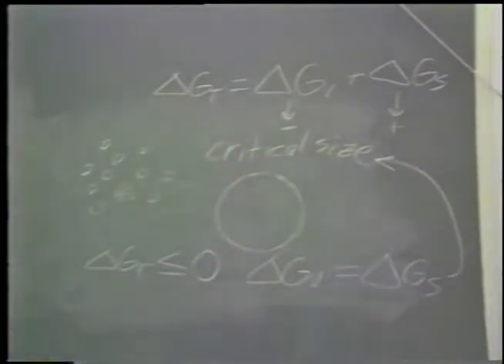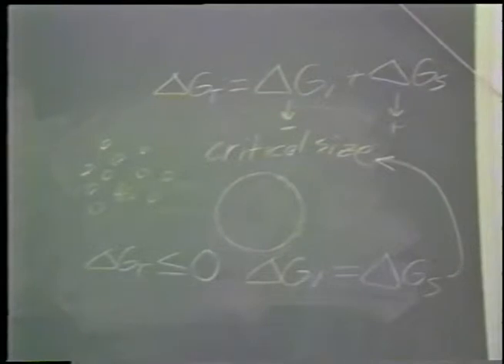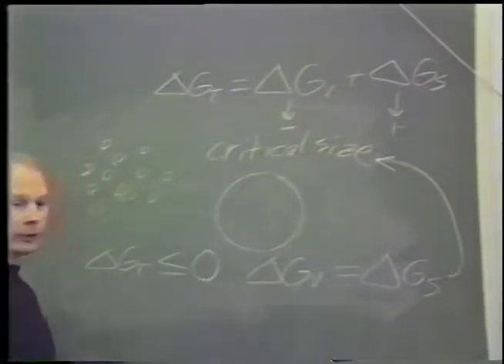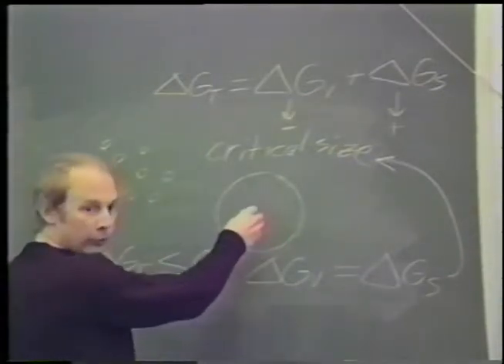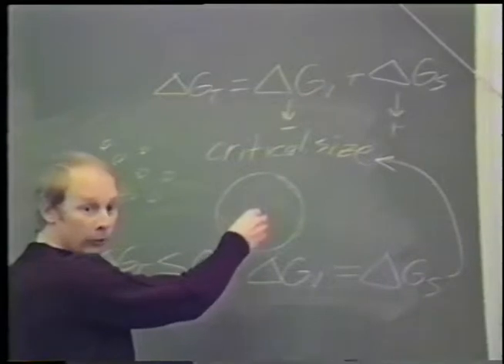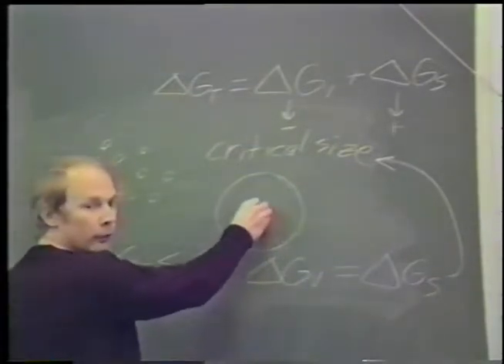Okay. Now, in nucleation theory, a nucleus composed of the molecules that are being grown as a crystal is called a homogeneous nucleus. So this description is for homogeneous nucleation. If there are particular contaminants present, then this doesn't necessarily hold. A particular contaminant may be stable at all temperatures. But as we were discussing earlier, biological systems don't contain heterogeneous nuclei, as a particular contaminant would be. The nucleation in biological systems always occurs through homogeneous nuclei composed of water molecules.